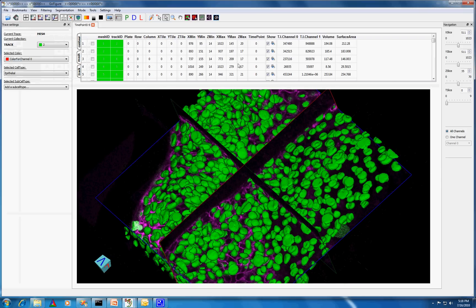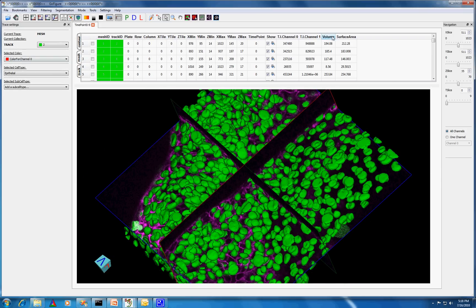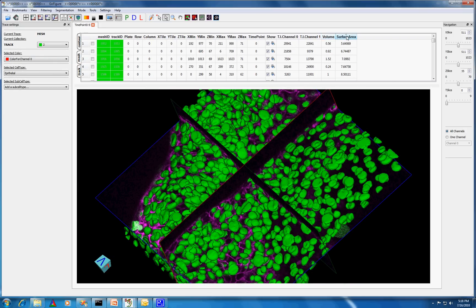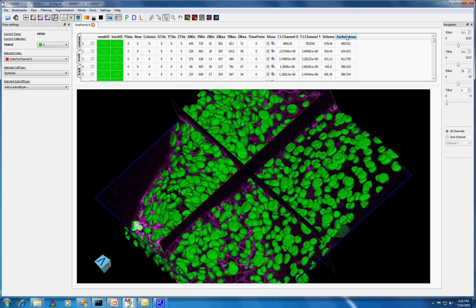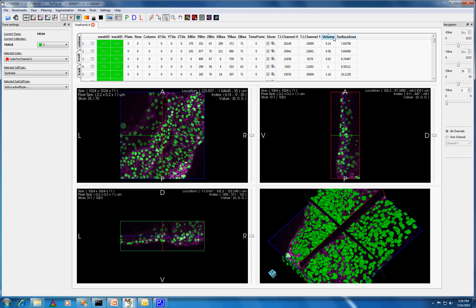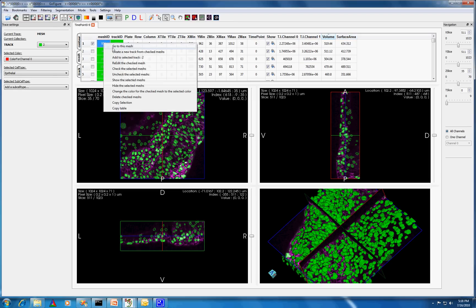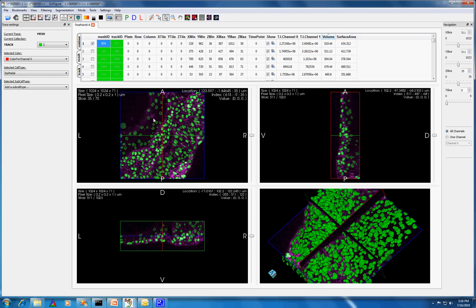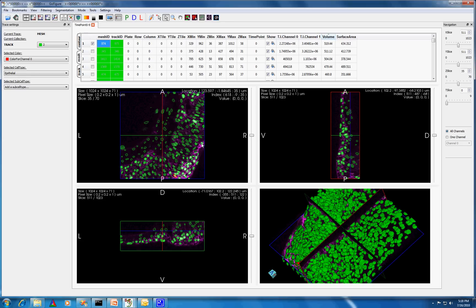Using the Table Widget, you can sort the results by volume or surface area to aid you in deciding which meshes need to be deleted or redone. So if, for instance, we want to look at the mesh which has the largest volume, you can use the GoToMesh action to locate the corresponding mesh in the visualization.